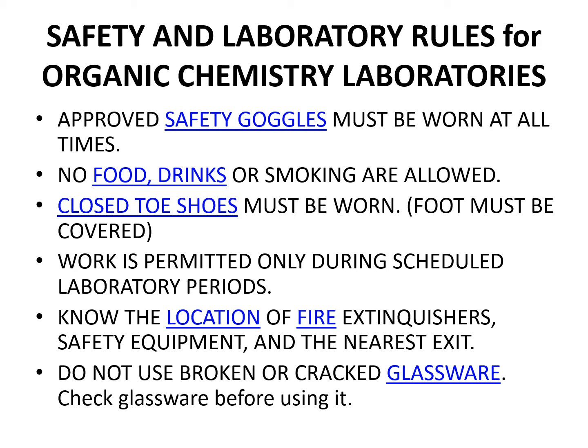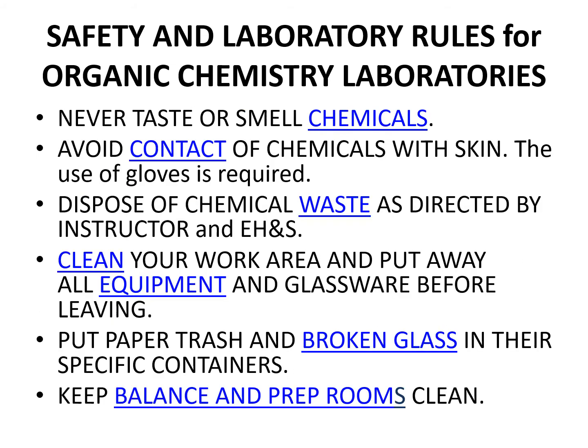While you're in the lab, of course, you need to know the location of any fire extinguishers, safety equipment, and the nearest exits. Of course, that won't be any issue for this semester, but generally that's a very good thing to keep in mind. Also, anytime you're using glassware, check everything, make sure it's not cracked or broken. If it is, don't use it. You're going to be doing a lot of heating stuff in the lab, so those cracks can expand and everything can go everywhere. So always check before you use any glassware.